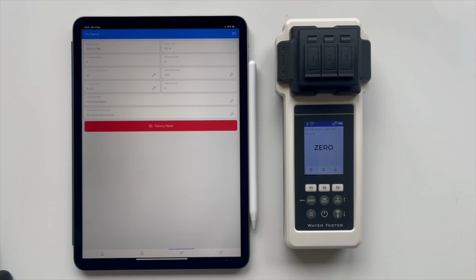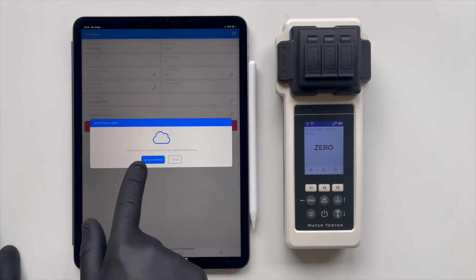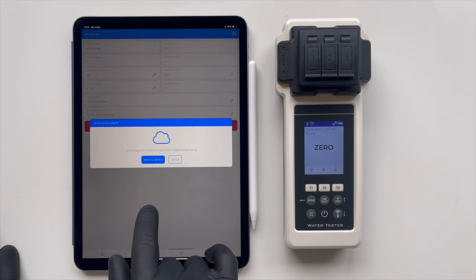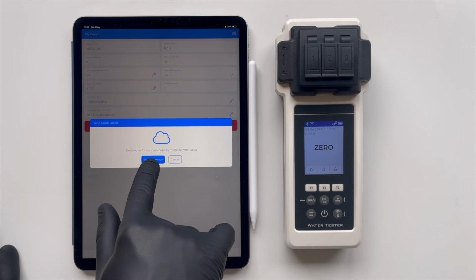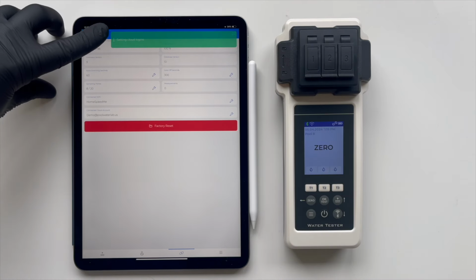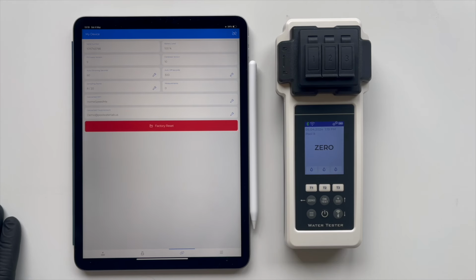We must connect the tester to the cloud storage to enhance its functionality and ensure all test data is securely backed up. Click on the wrench icon and then send to device to ensure the login and password are saved. By sending this information to the device, you facilitate seamless connectivity with cloud storage and other network services, enabling the tester to synchronize data, receive updates, and maintain secure communication with the connected systems. Wait until the banner disappears. All set. We've completed the necessary setup and we can proceed to the next steps.